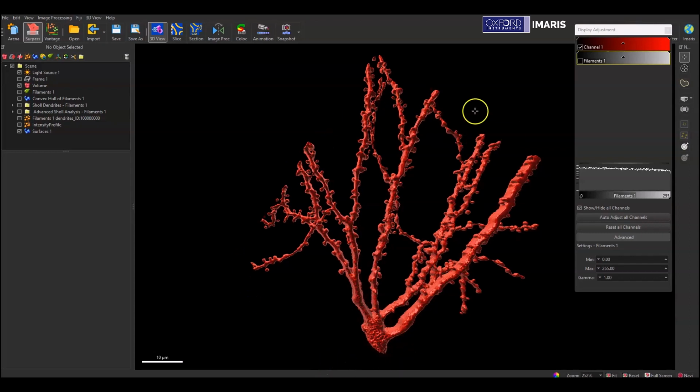detected. So here I have a surface object, and you can see that I have a black background. This black background can be part of my snapshot that I create, or it can be removed and just have a fully transparent background so that the only thing that's part of my snapshot is the surface object itself.